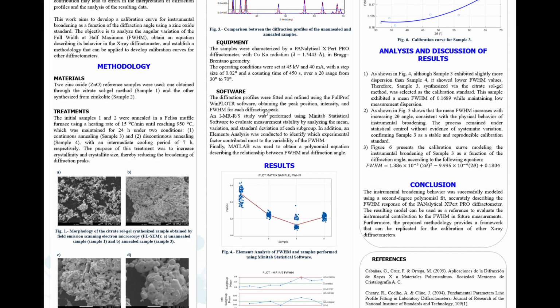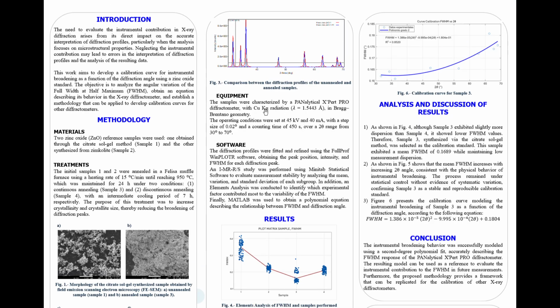Then the samples were characterized by a PANalytical Expert Pro diffractometer with copper radiation in a Bragg-Brentano geometry. The diffraction profiles were fitted and refined, obtaining the peak position, intensity, and FWHM for each diffraction peak.